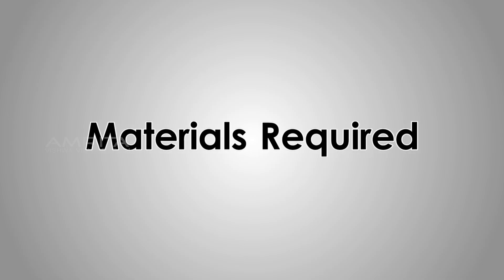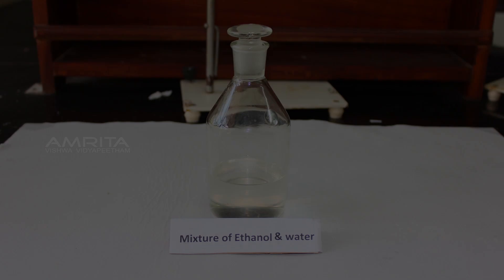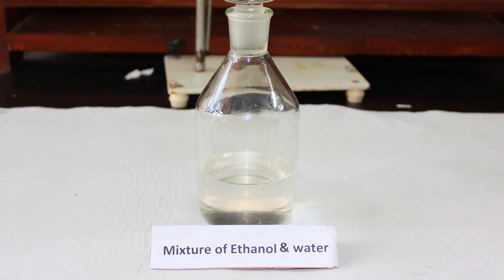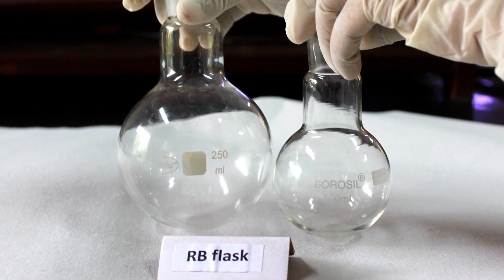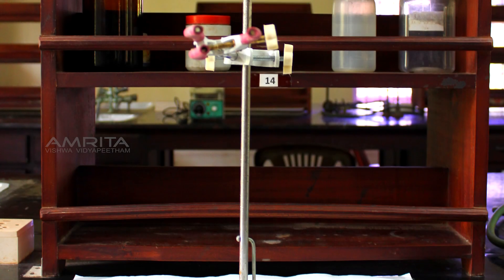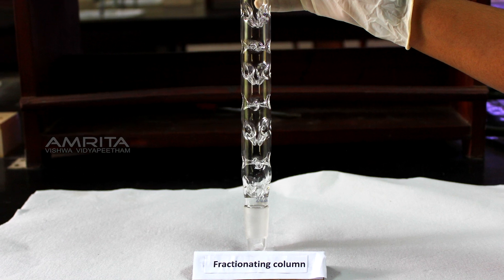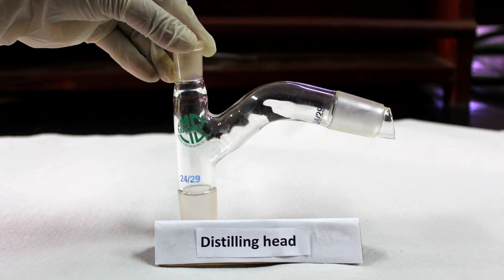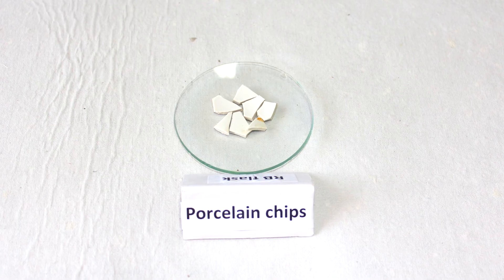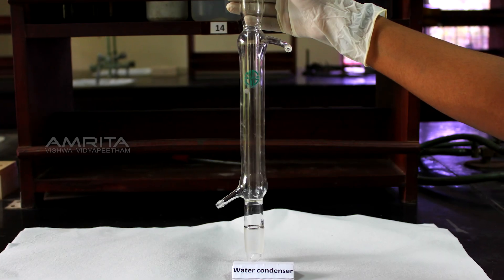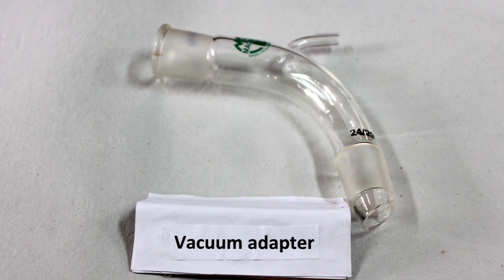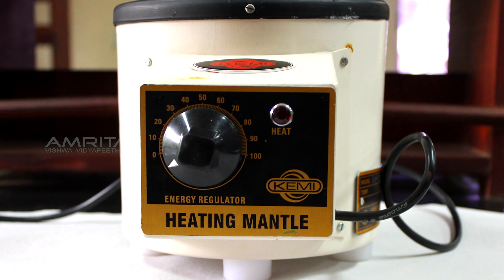Materials Required: Mixture of ethanol and water, 250ml and 100ml RB flasks, stand with clamp, fractionating column, distilling head, porcelain chips, thermometer adapter, water condenser, vacuum adapter and heating mantle.